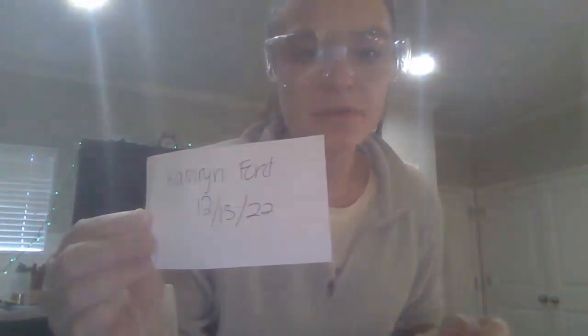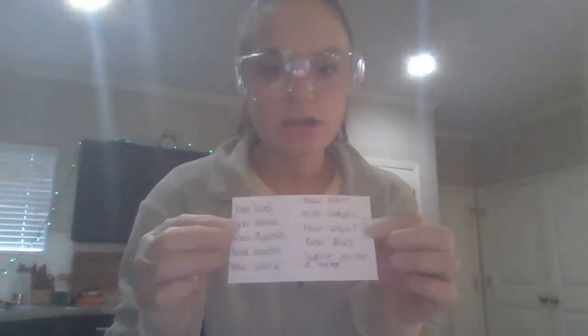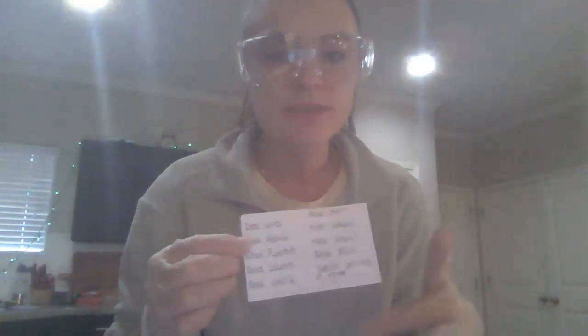My name is Kamryn Ford, and today's date is December 13th, 2022, and on the back of my card, I just have the names of the structures that I have to remember to talk about.